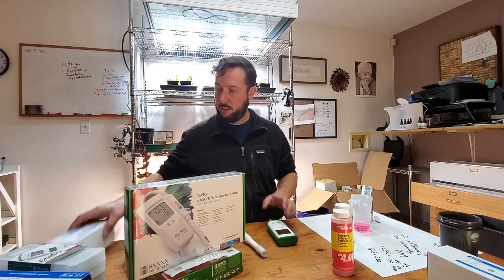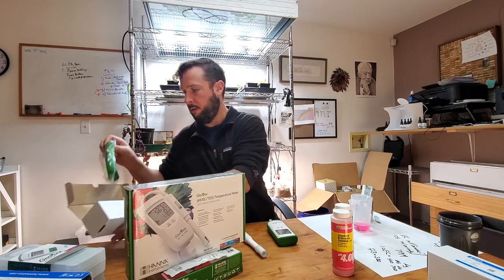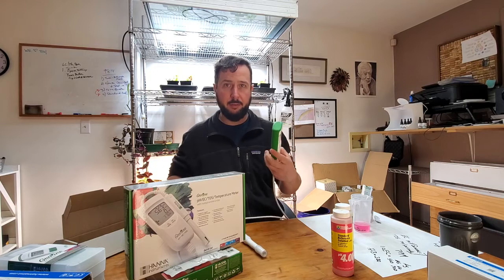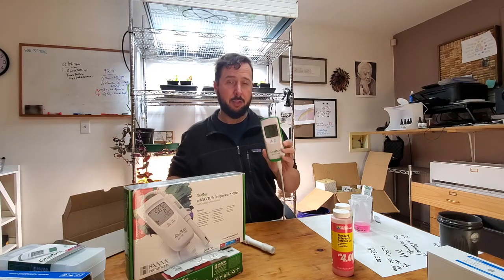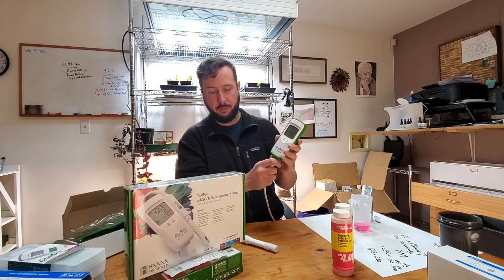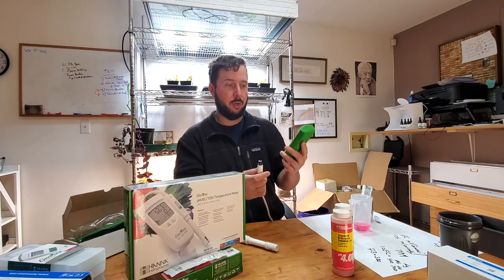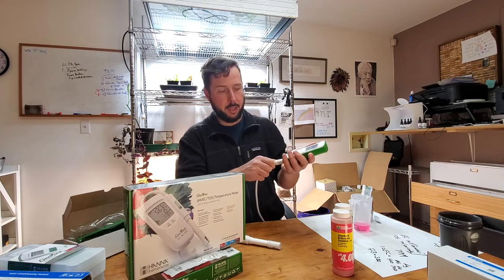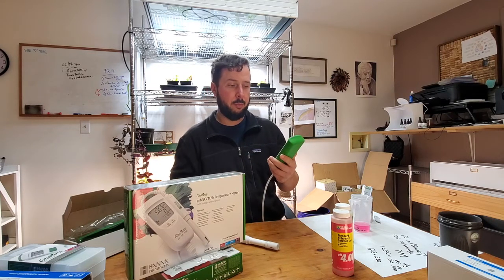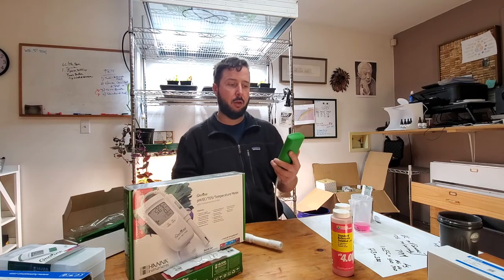One thing to note is that this little protective rubber green boot — I think they've even got different colors maybe — sold separately, definitely recommend it. Anytime, for whatever reason, you had to warranty a probe and got a new probe, you're going to want to clear the calibration in between and recalibrate the new probe, because the meter and the probe are technically independent of each other, and they need to talk to each other.